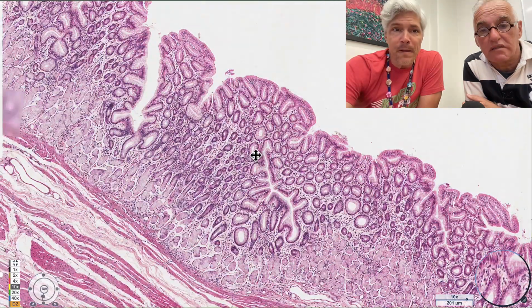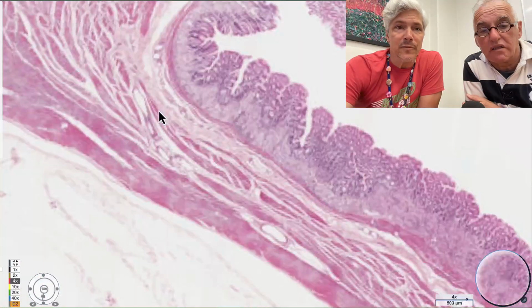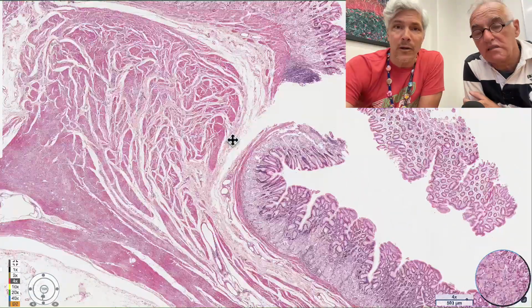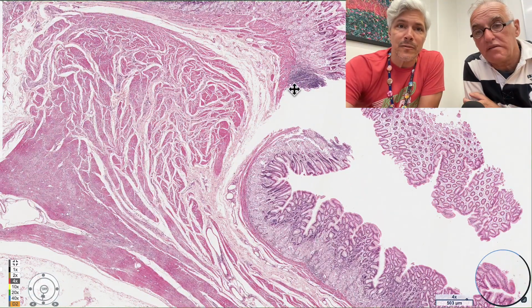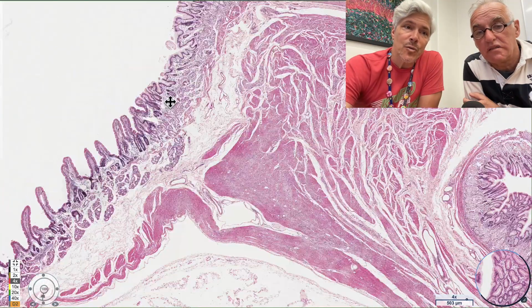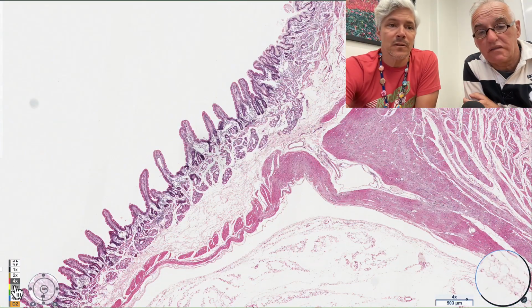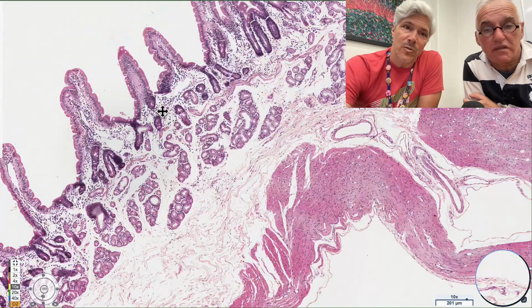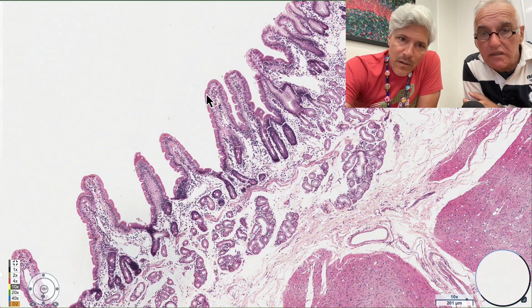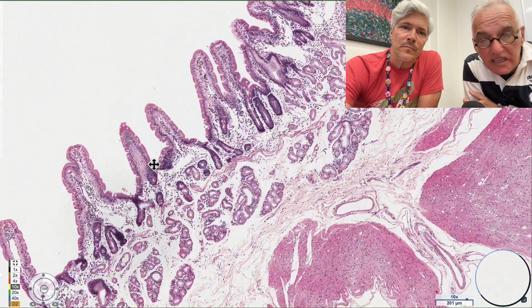Moving along, there is that very large expansion. I can go back to 4x here. Very large expansion of part of the muscularis propria right here. I think I see some lymphoid tissue right there, some lymphocytes. And then transitioning over right about here to a different epithelium. Let's take a look at that and note the distinguishing feature of this organ, a new one. What happened here? It changed orientation, so you've got a flat surface with upward projections and downward projections.